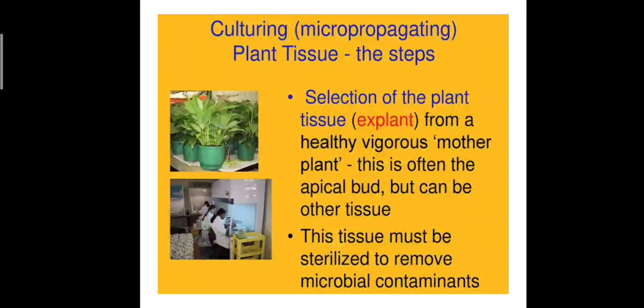Hi students, in this video we will be discussing the procedure involved in plant tissue culture, or the techniques involved in plant tissue culture. Plant tissue culture technique, we can classify it into three major steps.